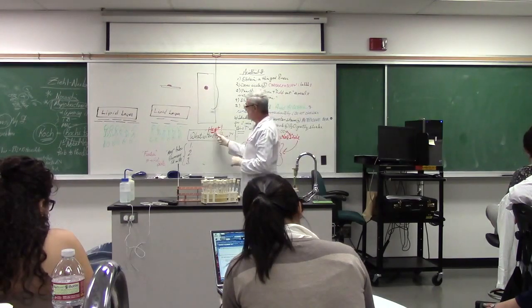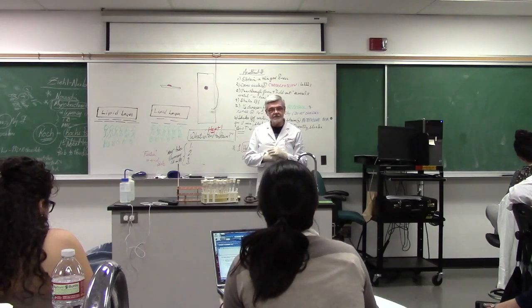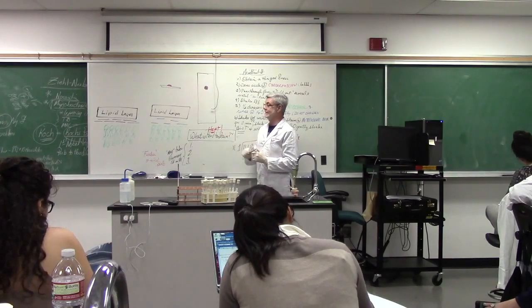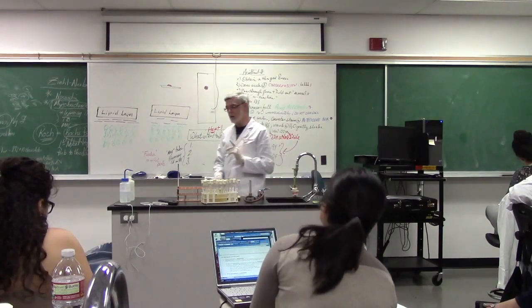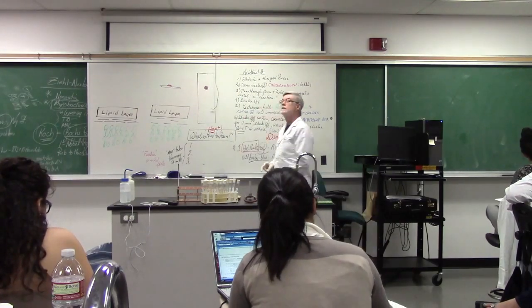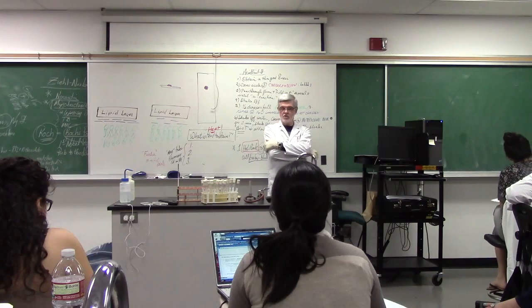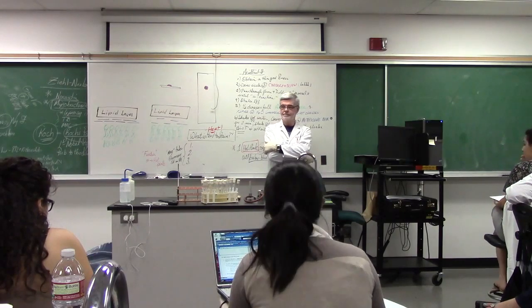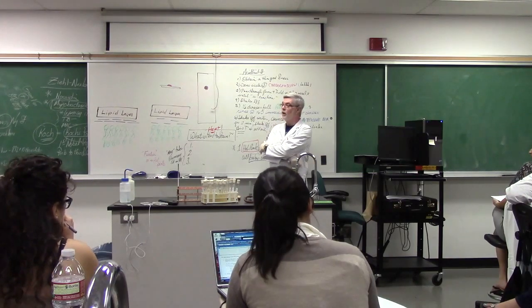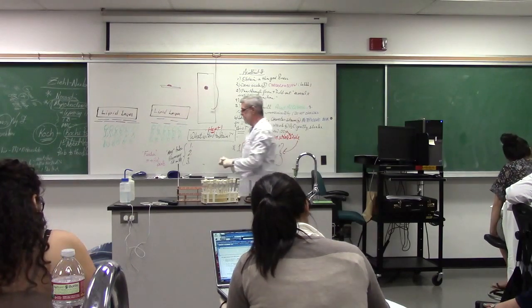And whenever you see the word heat, the secret communication we're trying to get across is, it's hard to stain this. It's hard. And if it's hard, you've got to involve heat. Now, in our class, in microbiology, name three things that are hard to stain that you may or may not have come across or have read about, or even used logic on one of them. We already knew one thing that's hard to stain. What is it? Lipids. Lipids are hard to stain.